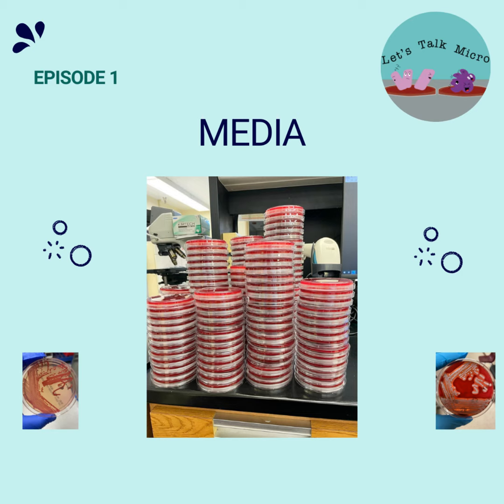And then we also have selective agar, and we have differential agar. Selective agar has one or more agents that inhibit the growth of certain organisms while selecting others. That's just what it is. Two classic examples that we have are PEA and MacConkey, right? MacConkey has those bile salts that inhibit the growth of gram-positive organisms. So it selects for gram-negative rods.